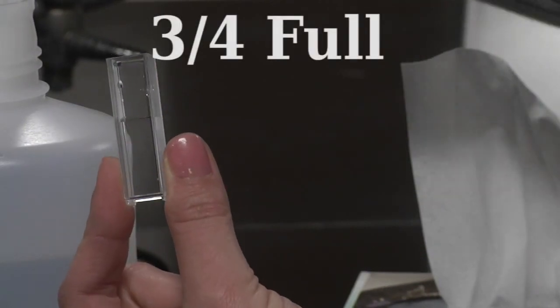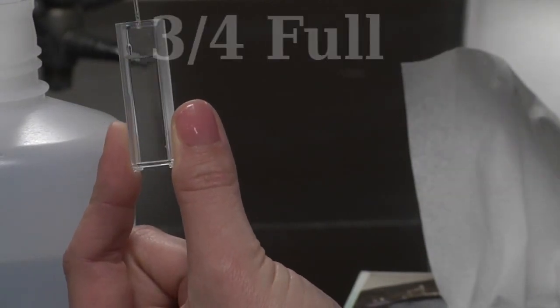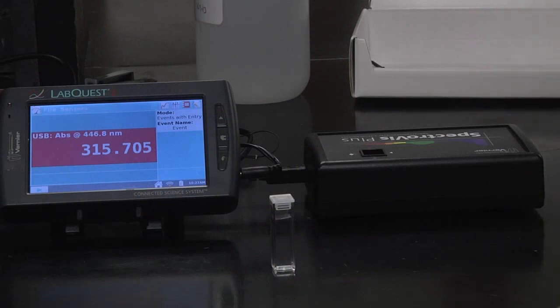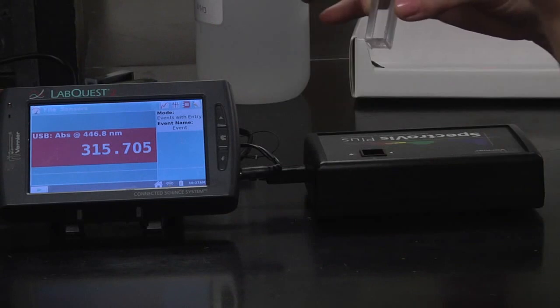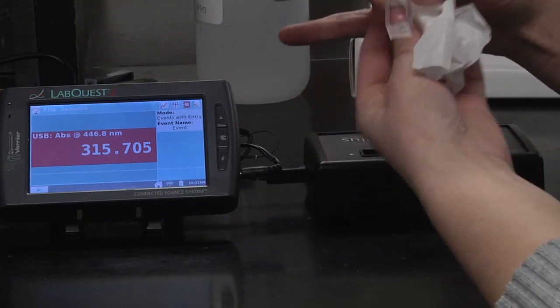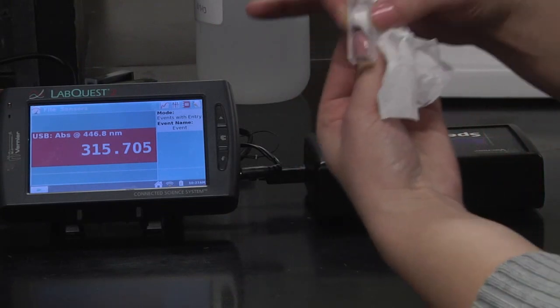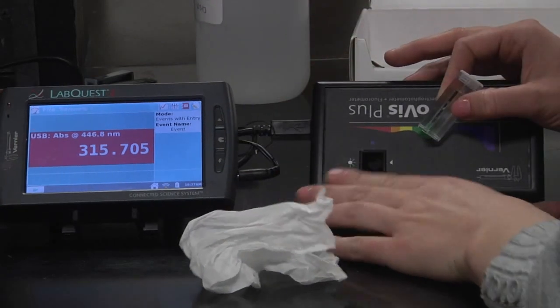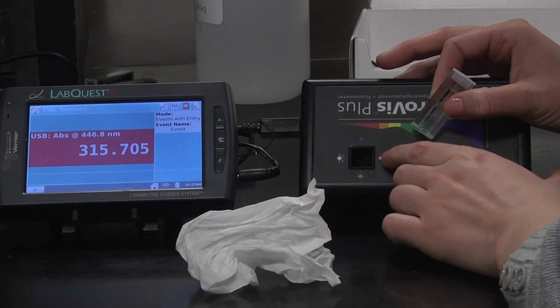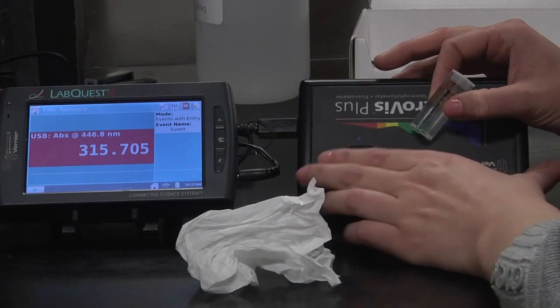To calibrate the LabQuest, we've already made our blank. What we're going to do is take a chem wipe and wipe the front and back, just in case your lab partner messed it up. Notice here how you have this little arrow. That's where the clear sides of the cuvette need to be, otherwise the light will go through the ridged portion. So ridges on the outside.